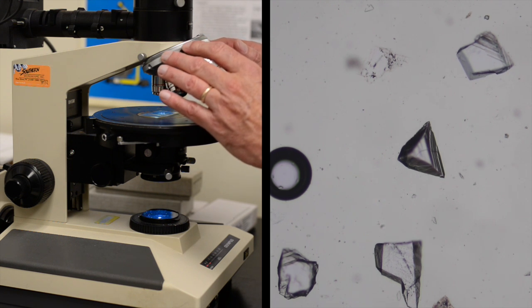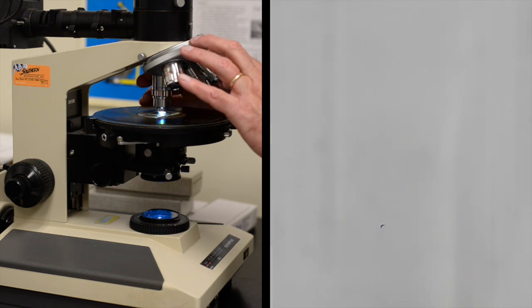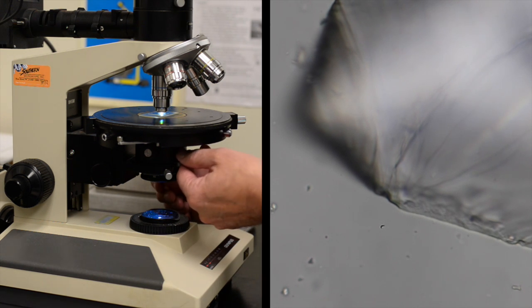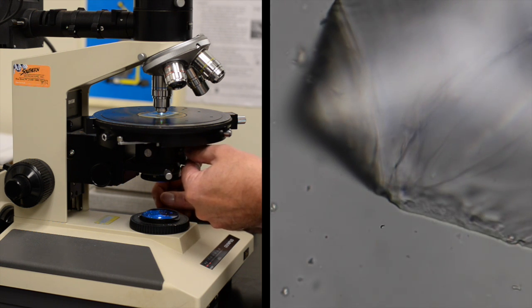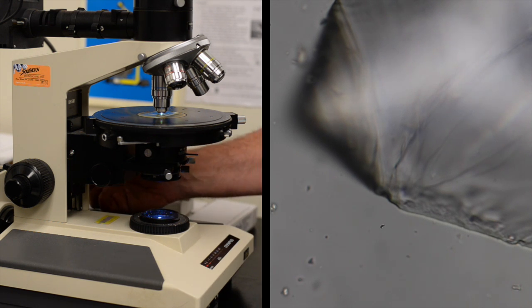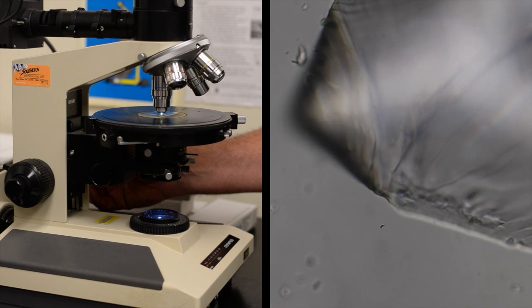The test works best at the highest power objective, which on this microscope is a 50x objective. So I'm going to swing that into the path of light. This is an edge phenomenon, so we're going to cut down on the light a little bit using a diaphragm under the stage, which enhances edge effects. Now the way to do the test is to lower the stage, increasing the distance between your eye and whatever you're looking at. You will see when I do this a halo form. In this case it's going to move out of the mineral into the epoxy as I lower the stage.